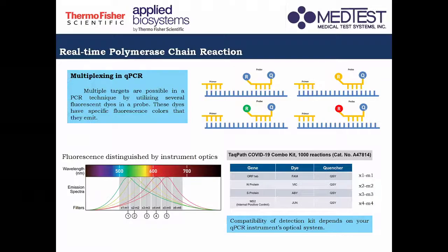these targets. Now, compatibility of the detection kit. Now, for your Quant Studio 5, we have to be aware that the type of kit that you would want to use with your instrument, you have to consider kung yung ginagamit bang dye nung kit na yon ay pasok dun sa range ng detection ng instrument.